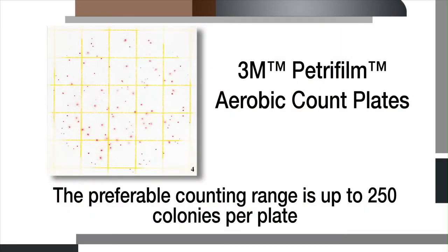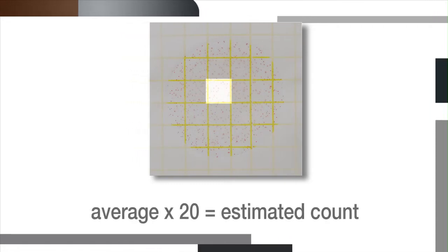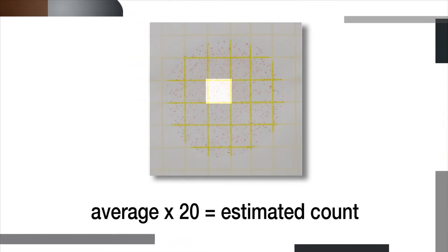The preferable counting range for the 3M PetriFilm aerobic count plate is up to 250 colonies per plate. For counts over 250 colonies, you can estimate the count. To do this, first count the total colonies in one or more representative squares and determine the average number per square. Multiply that number by 20, which is the inoculated area of the plate. The result is your estimated count.